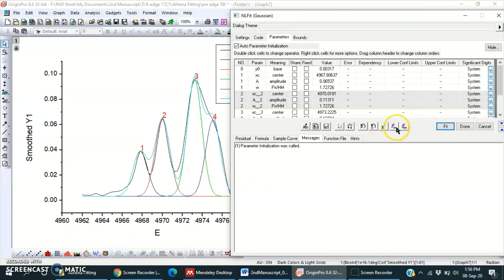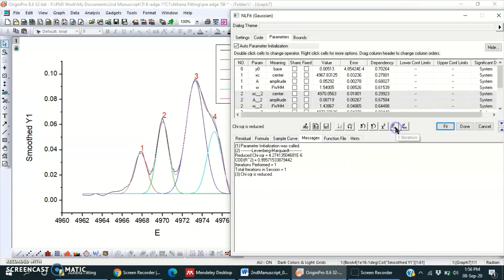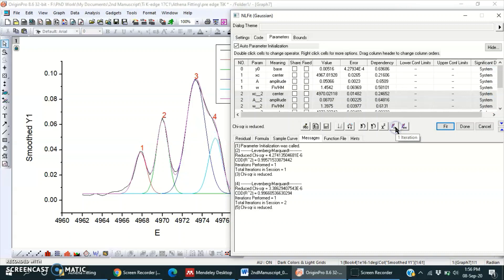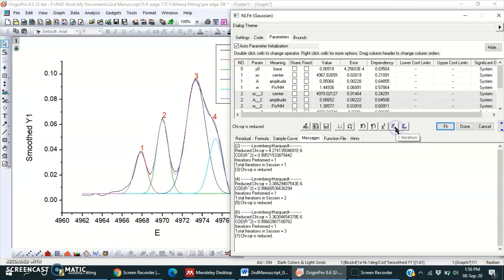So first iteration, second, third, fourth, fifth.